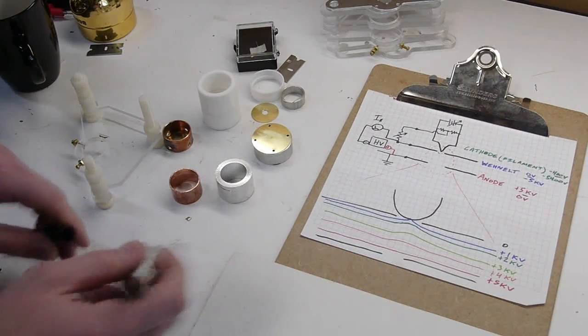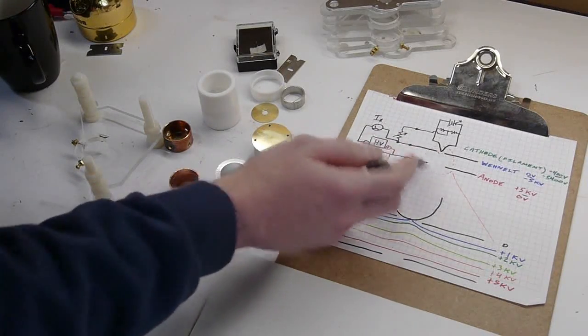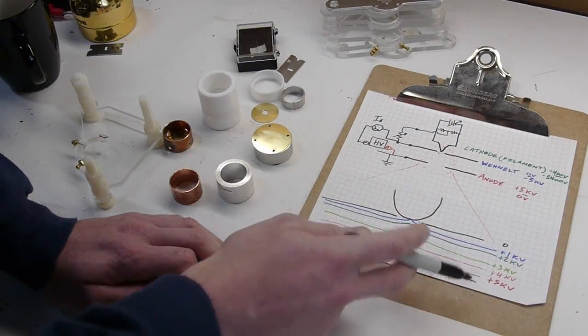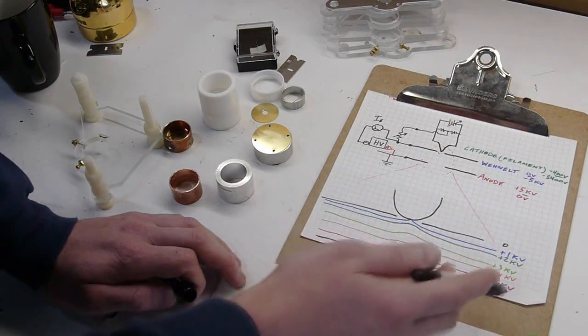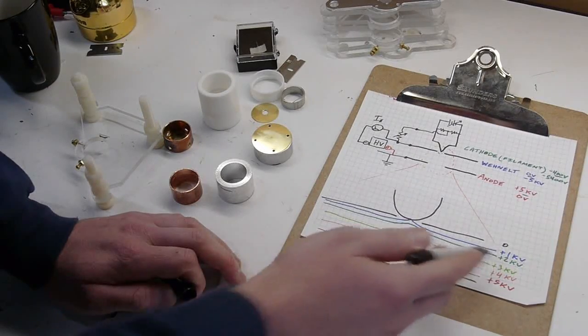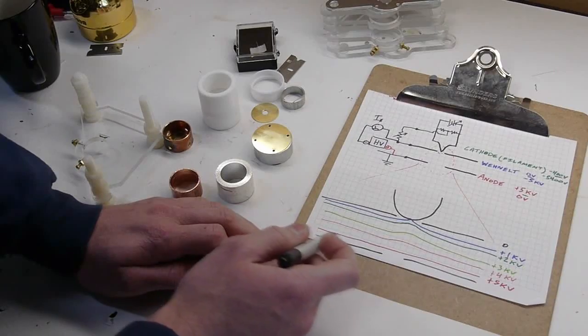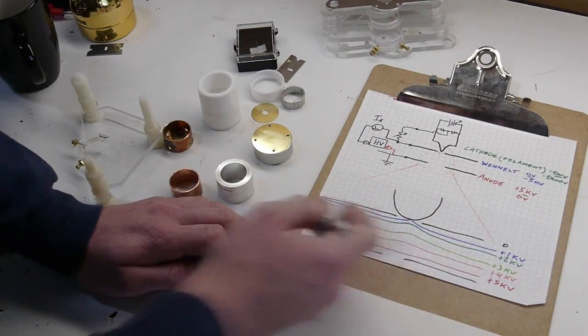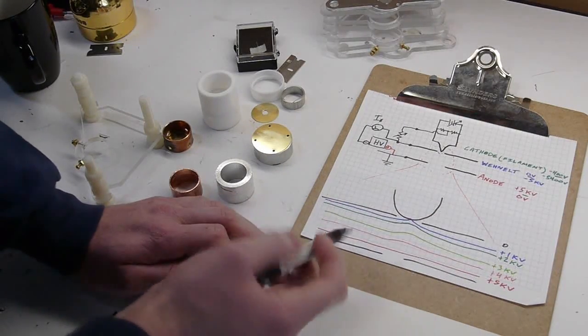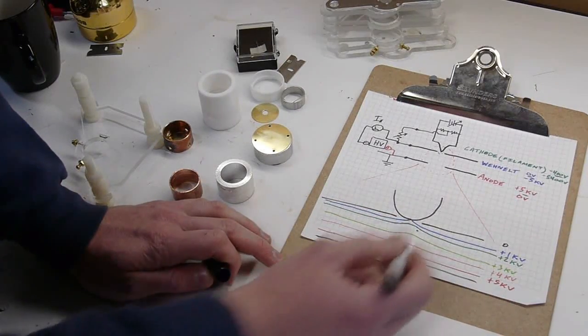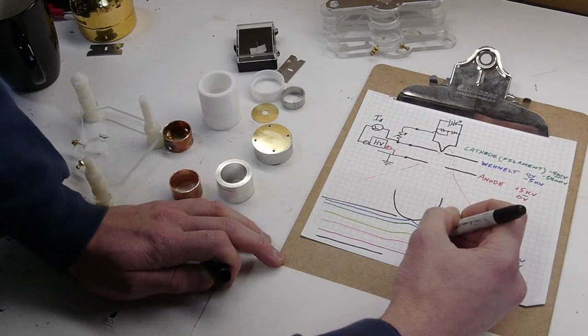And the field looks kind of like this. So this is a close-up of the action here. And again, I'm sorry about the voltage conventions. I said 5 kV at the bottom and zero at the top, but I hope that's okay. The field is very flat.